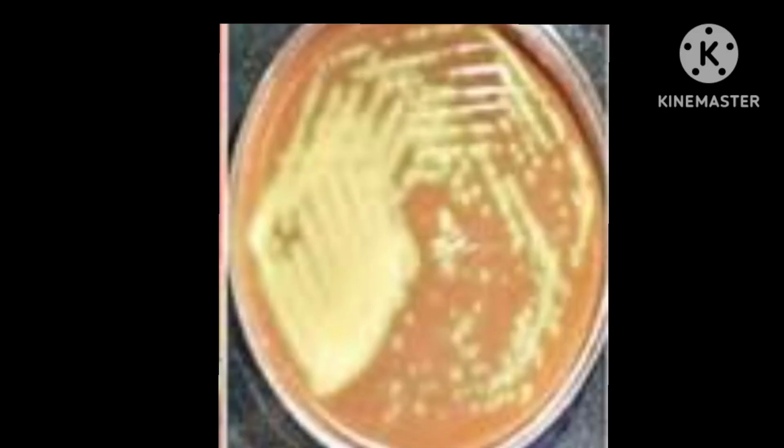Some books explain alpha hemolysis as partial hemolysis, but the actual mechanism is formation of methemoglobin. There are no hemolytic enzymes involved in this reaction. The bleaching of alpha hemolytic colonies on chocolate agar is also due to the formation of methemoglobin.